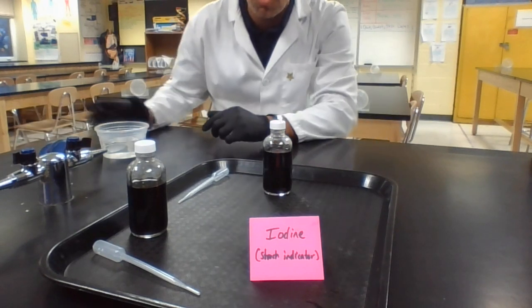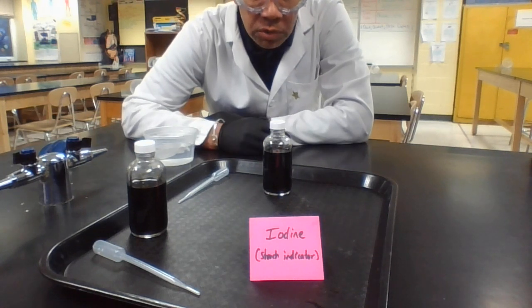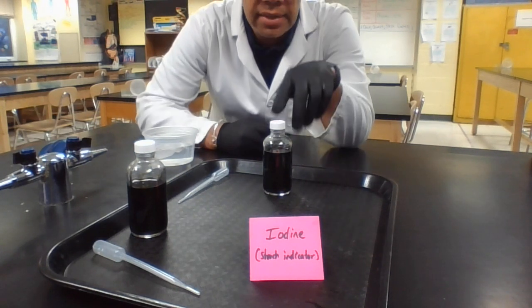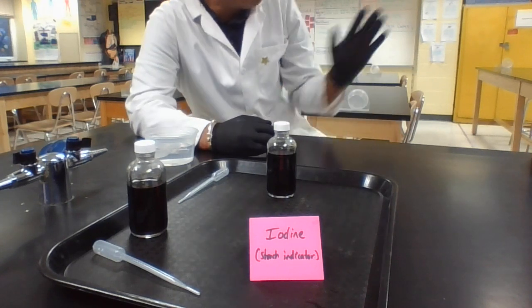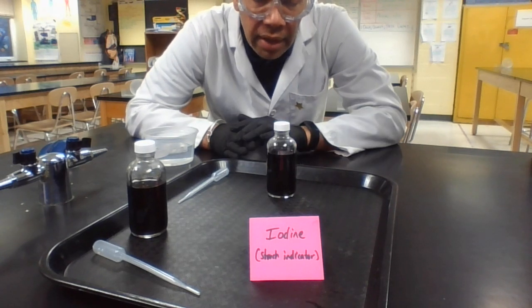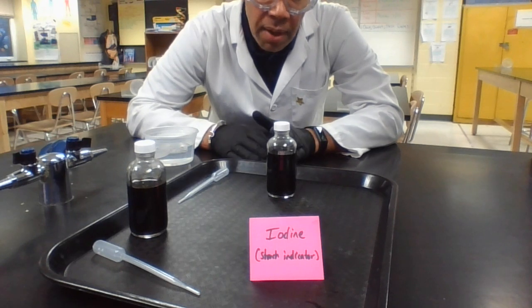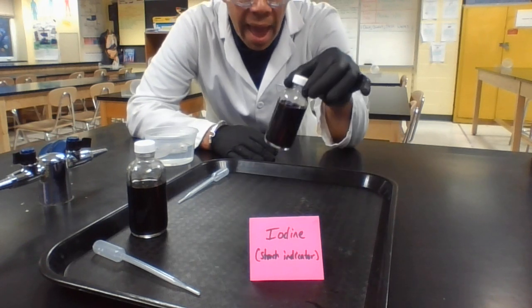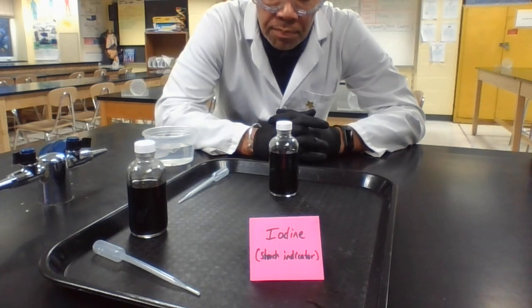Hello. Okay, so we're over here at our final station, our final area for today for what you need for this lab. This is iodine. Okay, now iodine does a great job. We learned about iodine in a periodic table. This is actually not straight up iodine. It's a compound. Okay, and so it's bonded with another element, but it has the element iodine in it that we're trying to use its properties.